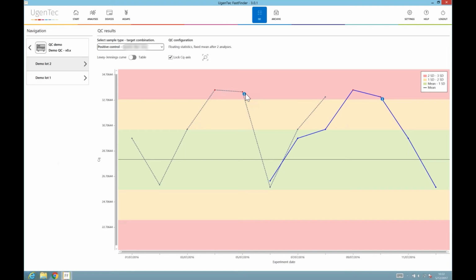What we normally see is, of course, people adding things into spreadsheets, putting lot numbers into spreadsheets, and then if there's anything going on downstream with that, in terms of the quality control analysis, it's often a case of recovering this from the spreadsheets in either a completely manual or a semi-automated way.